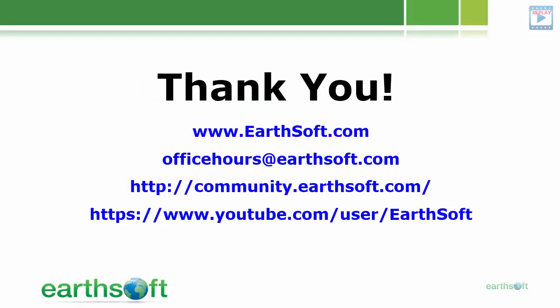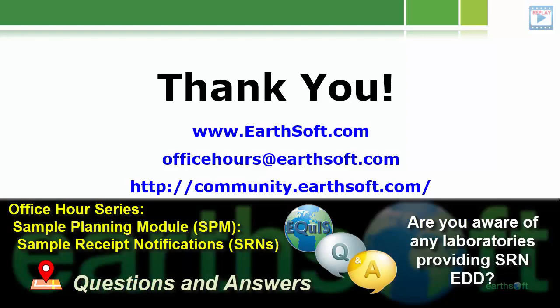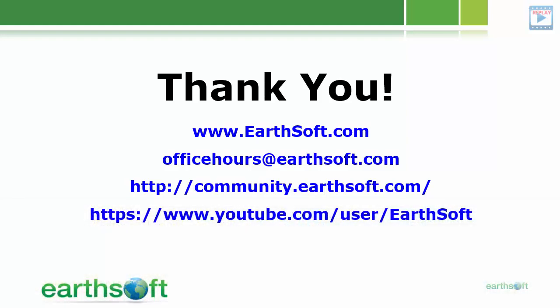So yeah, I'll go ahead and take questions now. It looks like we've got a couple of questions here. John asks, are you aware of any laboratories providing the SRN EDD? I believe that we have at least one client in Australia that is getting an SRN EDD, but I'm not sure which laboratory they receive that from. There's at least one client, but possibly others that are able to do that.